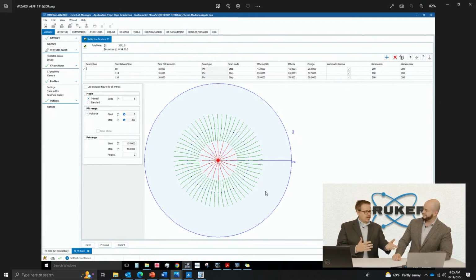So what you can imagine when you see these little graphs, the circles, is that it's basically that hemisphere squished down. We call that a stereographic projection. There are other projections, like equal area, but that's often the word. We also call it a pole figure. And when we say pole, we just mean the pole sticking out of the surface of one of those orientations.